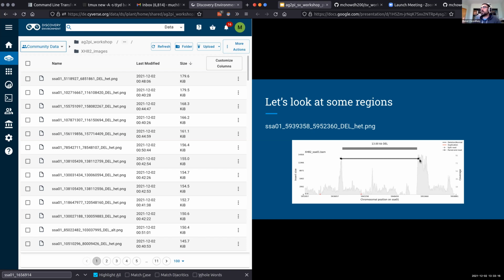So that's something that you can fine tune yourself when you're trying to design your own exclude regions. And that's something you kind of have to determine, perhaps experimenting on a single sample to see how well your exclude regions are excluding regions like this.